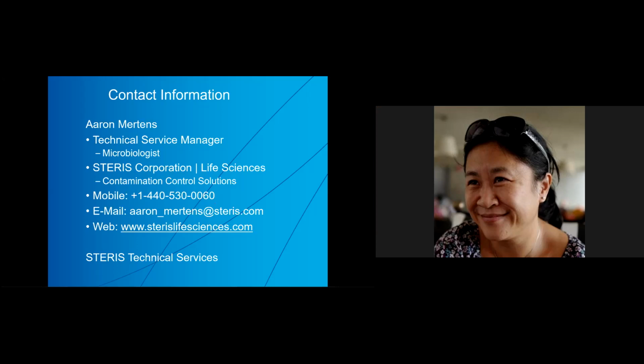For cleaning validation, we do lab scale studies or clean characterization studies to determine cleaning contact time requirements. Are there any similar studies for sterilization to determine the SIP hold time requirements, instead of going by a blanket 121 to 121.1 centigrade for 30 minutes?